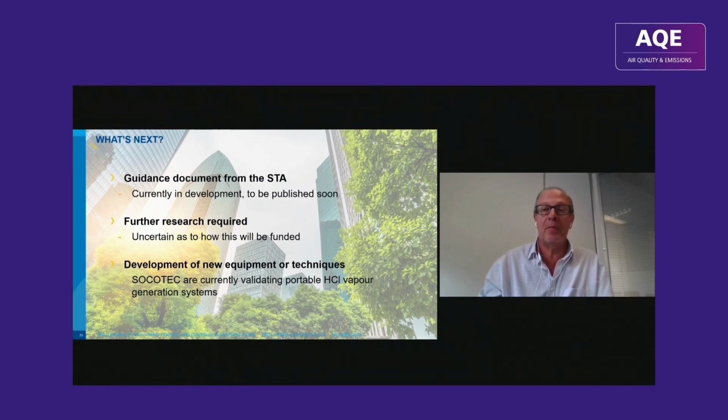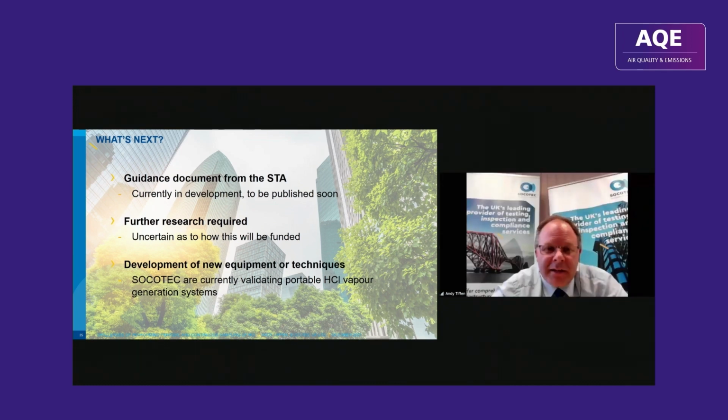Good, bad idea? Yeah, I think it would be a great idea. One of the things that we would like to move away from, because of this uncertainty of dry gas cylinders and whether they can be validated, we would prefer to see our sample systems that we use on site validated in the lab against a vapor generator. But at the moment, as I said, those vapor generators tend to be lab-based bits of kit. So it would be great to have those validated. And if there was then a system for certifying sample systems to prove that a particular configuration, particular material can transport HCl to an analyzer, that would be ideal.